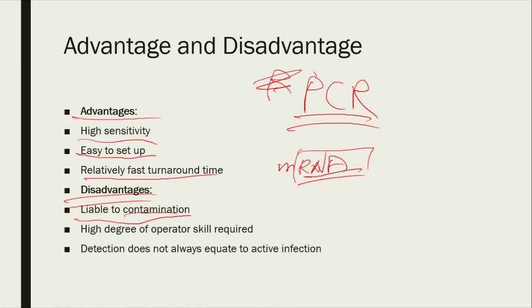And also tied to operator skills, okay? Students in my lab started off doing PCR. The first 1 or 2 were maybe not so successful, even though I was doing it along with them. And the idea behind it is that it needs practice, okay? After a while, people get good at it, but still, it requires some steps involved.